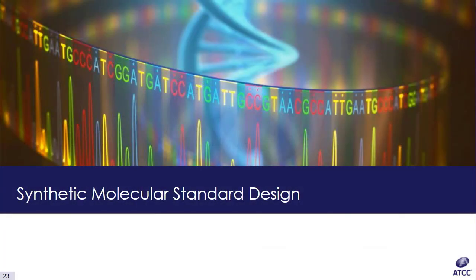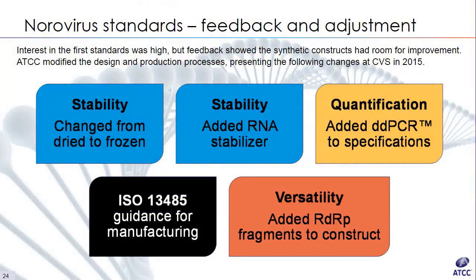Next, I'm going to change gears a bit and go into a little bit more depth on the design process for the synthetic standards. And I'll start with some improvements we made from the first generation synthetic constructs, which included a West Nile virus and norovirus genogroup 1 and 2.